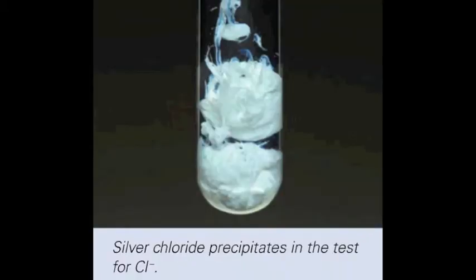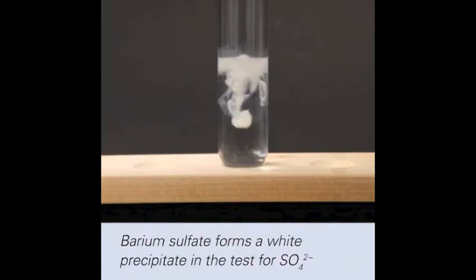Certain anions can be identified by precipitation tests. To identify aqueous chloride solutions, Cl-, a few drops of dilute nitric acid are added to the sample solution, which is then shaken. A few drops of silver nitrate solution are then added. A white precipitate of silver chloride forms if the sample contains chloride ions.